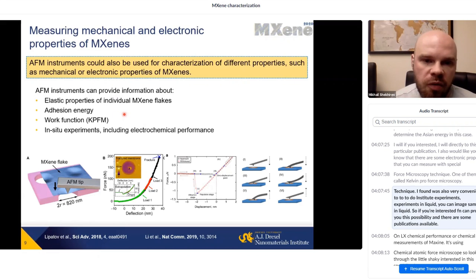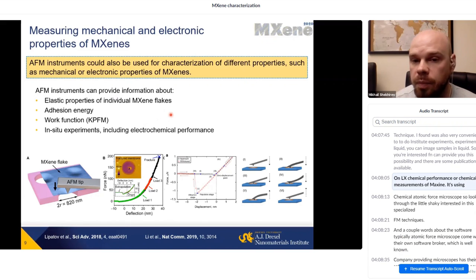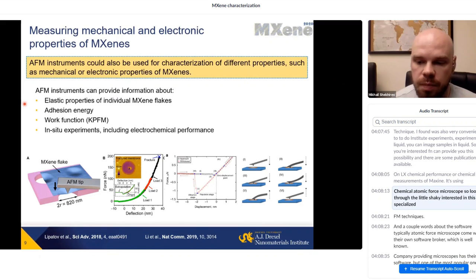AFM is also a very convenient tool to do in situ experiments. You can do experiments in liquid and image samples in liquid. So if you're interested, AFM can provide you this possibility. And there are some publications available on electrochemical measurements of MXenes using electrochemical atomic force microscopy.